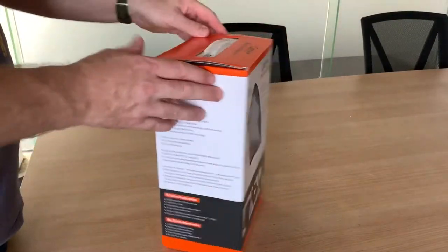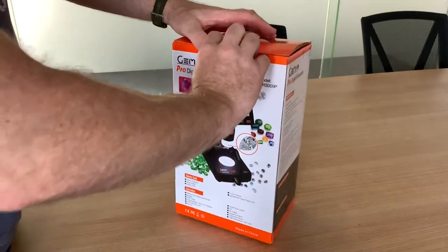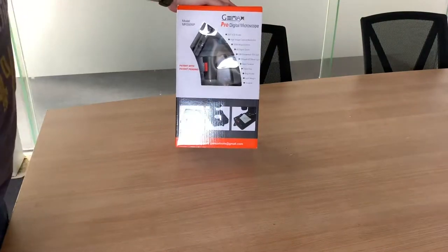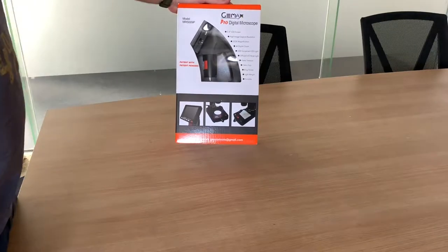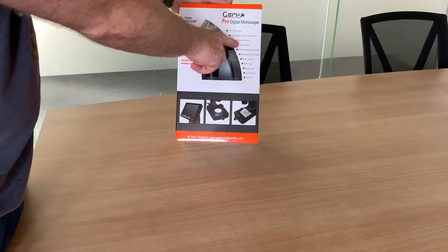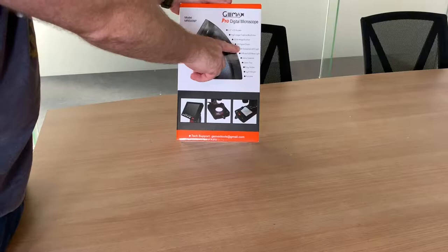We've got a new product here, I'm just going to give you a quick run-through on it. This is the pro digital microscope. It comes with a 3.5 inch LCD screen, high image capture resolution, 220 times digital magnification plus four times digital zoom.